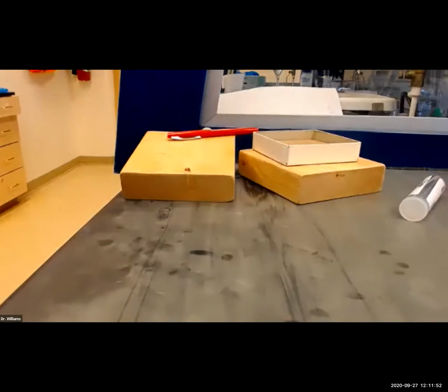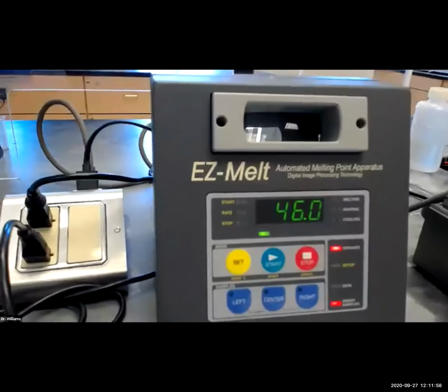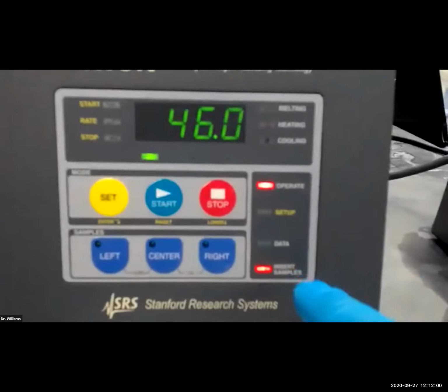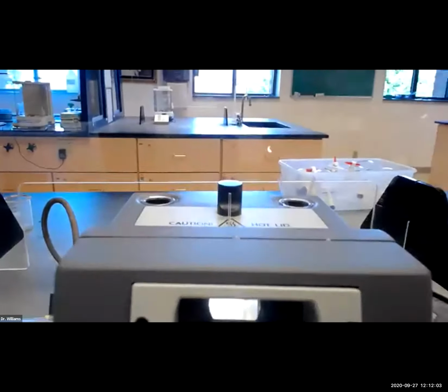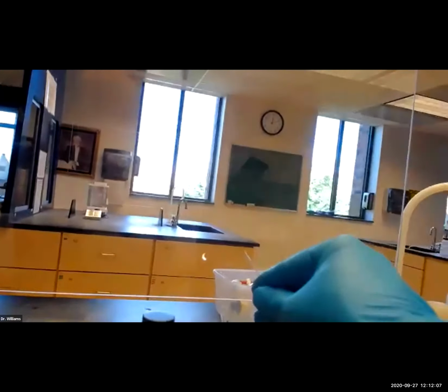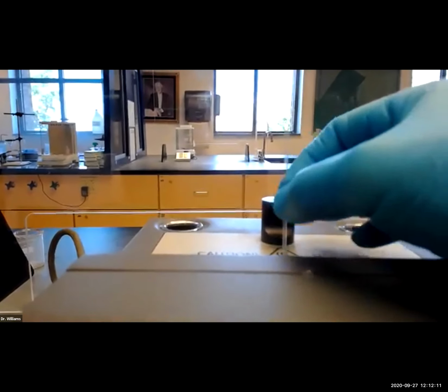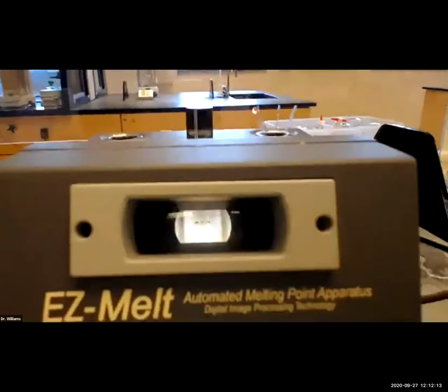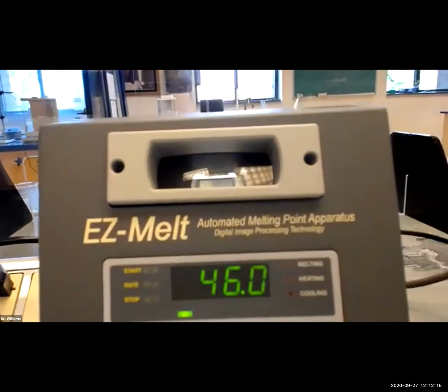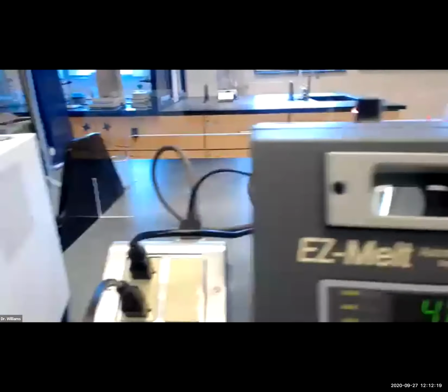I'm going to pause the video. I guess not. We're not going to pause the video. All right. So place the samples at the top. By the way, there's the button, right? Insert samples. That's great. Go up here. This is left over from before. This comes out into the waste. And then just put this, there you go. You can't see the sample because of the glare, but it's in there. So check to make sure you can see the sample.